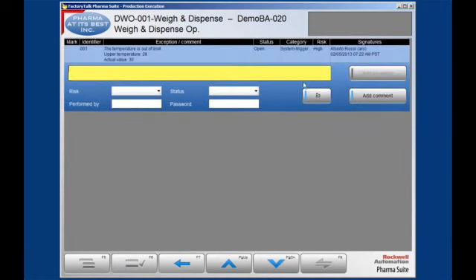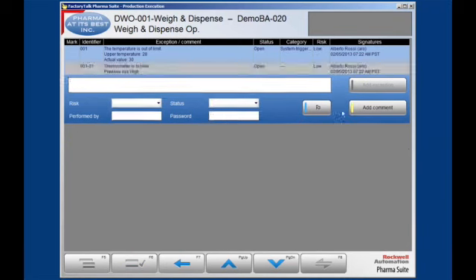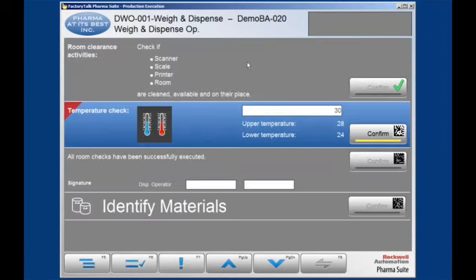We can also enter a comment stating a reason for this exception. A comment is not mandatory, but may offer some clarification. Then sign off. However, if this comment should be highlighted for quality personnel, a flag can be raised. After signing off on the exception, PharmaSuite shows the corresponding phase is marked with a red triangle at the corner in the upper left.